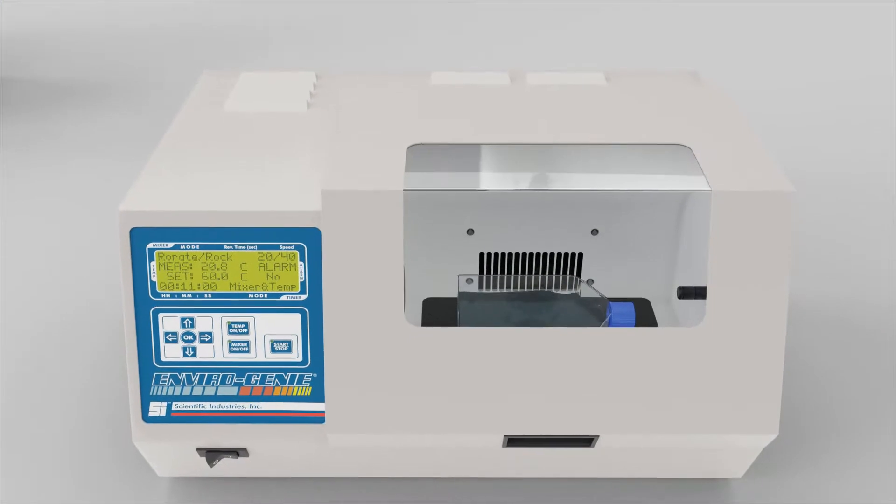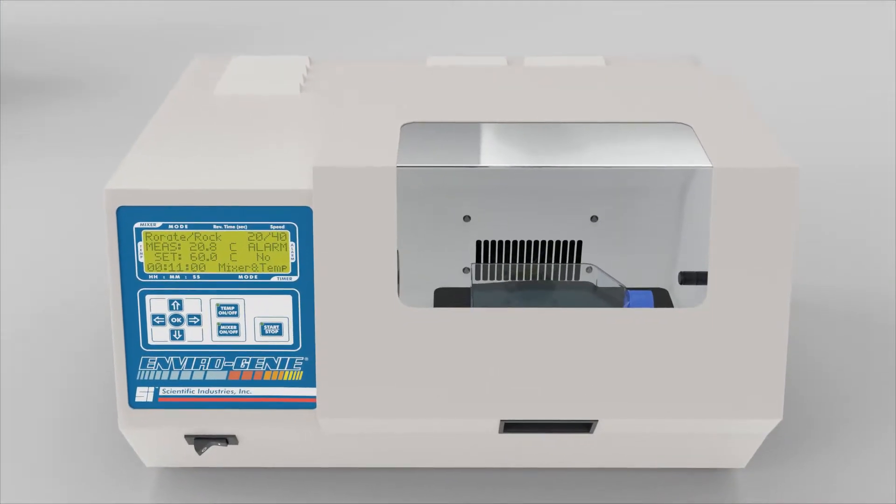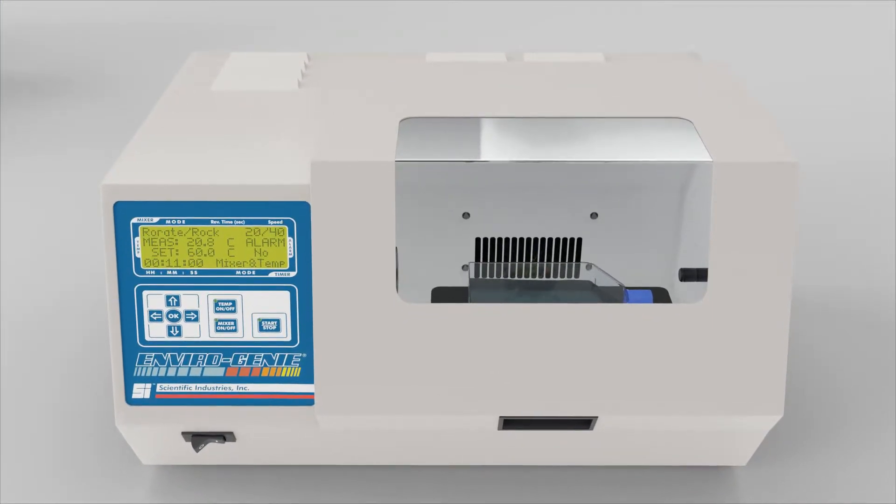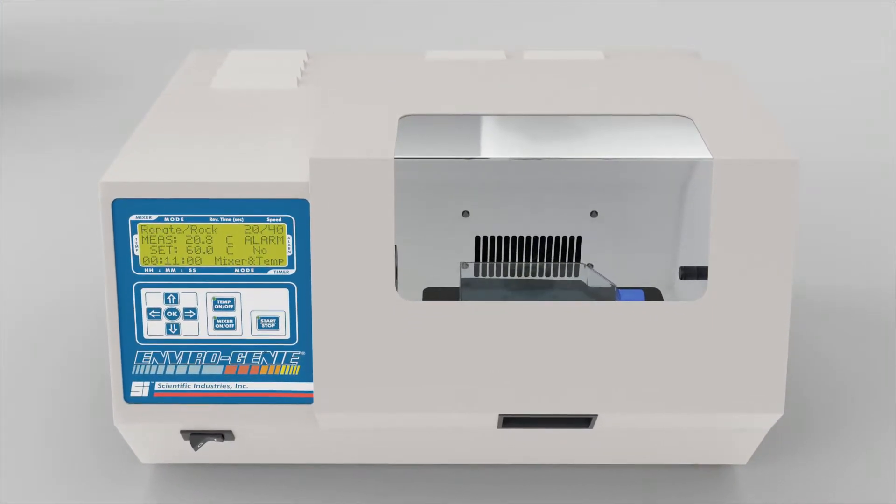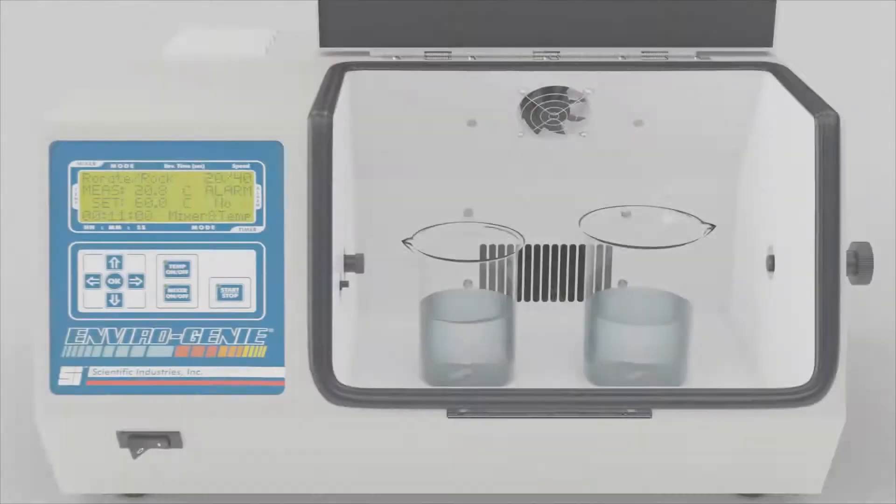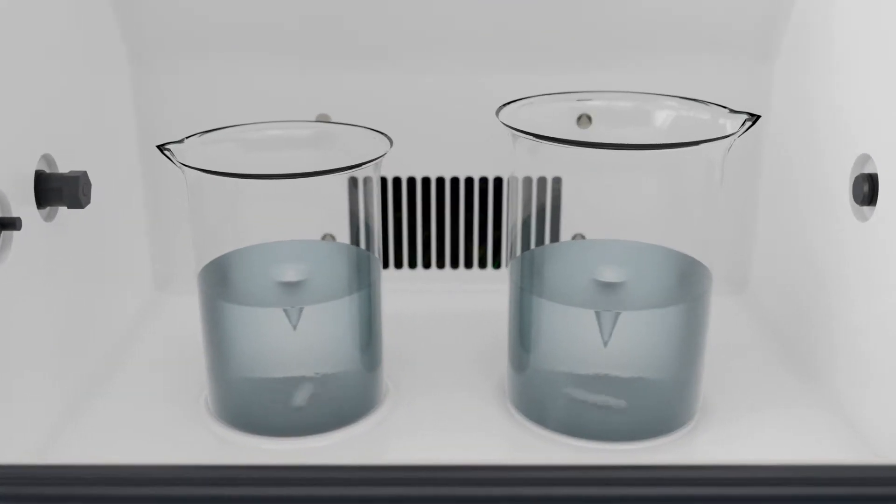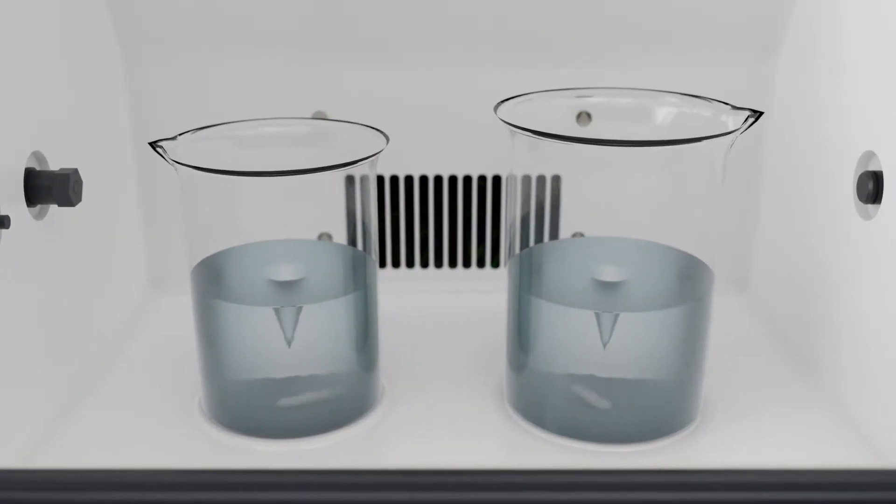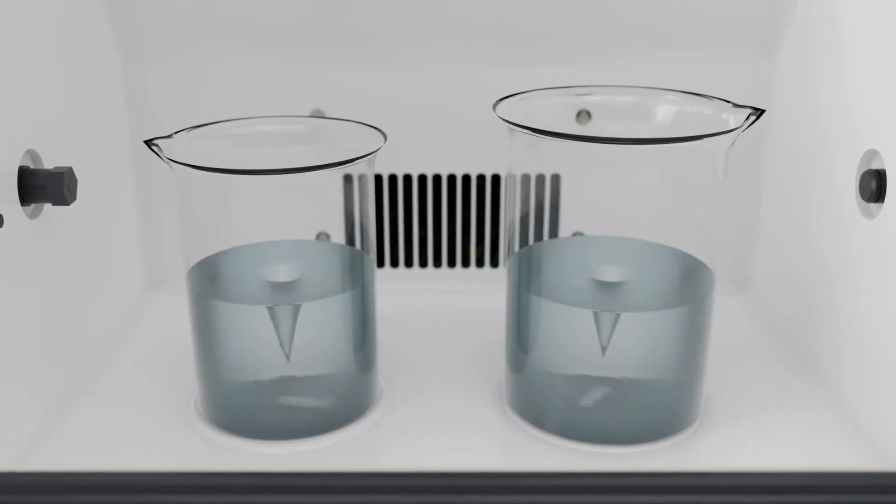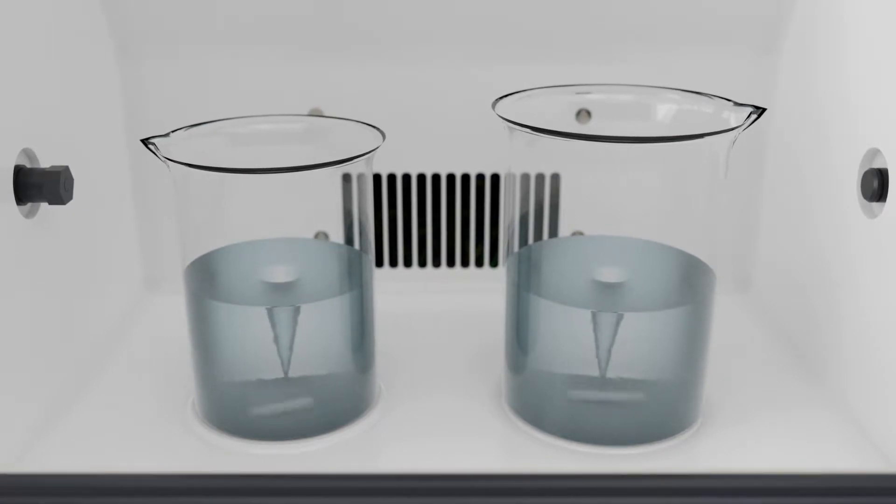The Enviro's built-in unique Peltier technology allows precise heating and cooling to as low as 4 degrees. Its two position magnetic stirrers make the EnviroGenie one of the most accommodating incubators on the market.